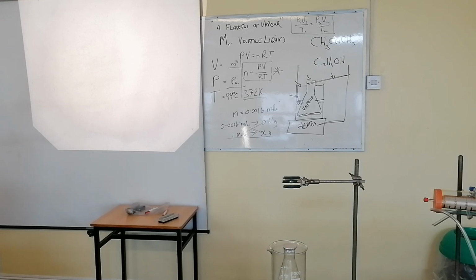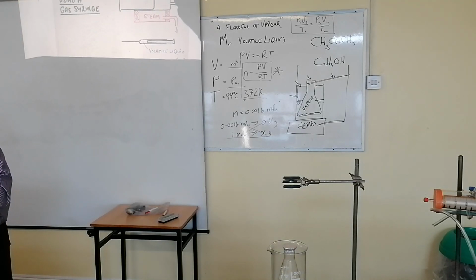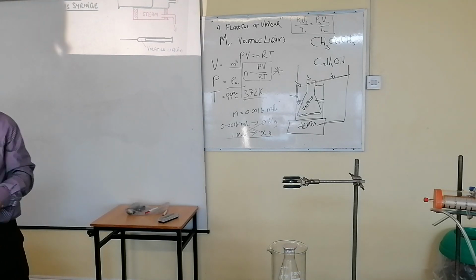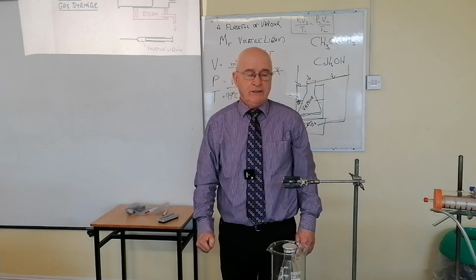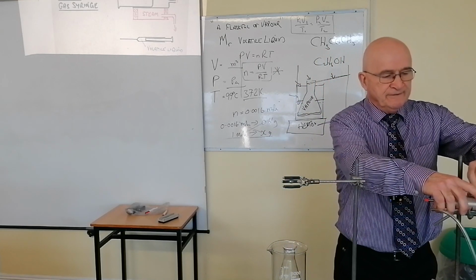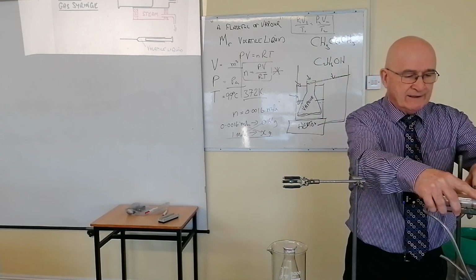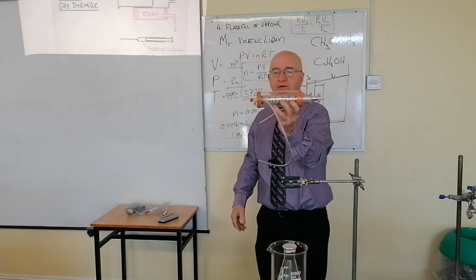Now there's an alternative method of doing it. I better just mention it briefly in case any of you have used this method at any stage before. I'll just show it to you briefly. Now before I start, can I say this to you? You don't need two methods. You can do it by any method, provided you describe it correctly. The second method involves basically a gas syringe in a steam jacket. And I'll just show you briefly what that is now.